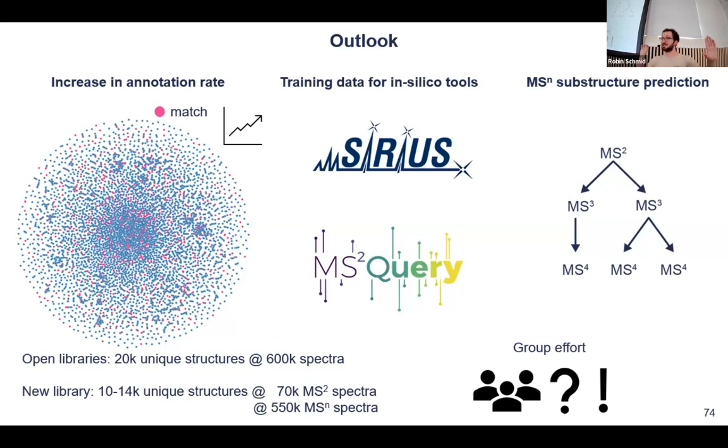Yeah, we had some people that even did a full injection, and they extracted the MS1. And then from that, they did some pre-processing. They made an inclusion list, and then they injected again. But for us, it was really like, why not directly do DDA? And if we miss out something, we can still go back and do multiple injections more, but we already have information, and we might even see that some of the fragmentation energies were still too low. Even though using 3 different energies, we can then go back and say, okay, we want more out of this, and we can go back and inject more.